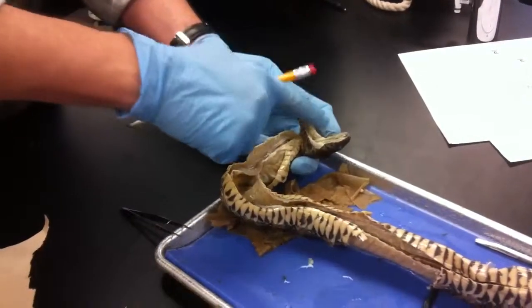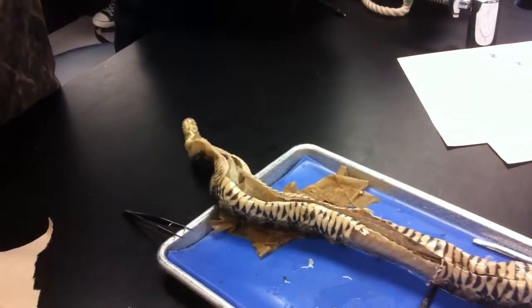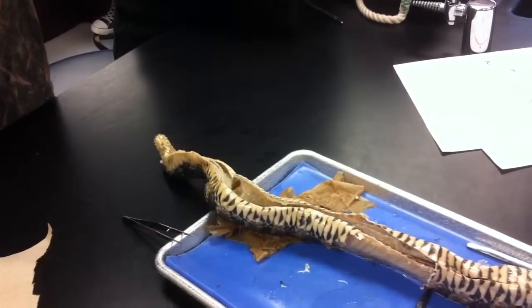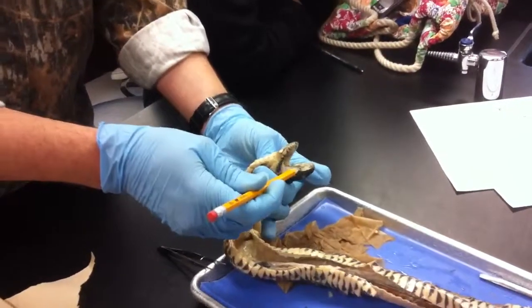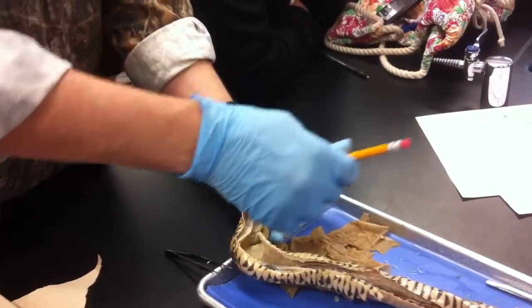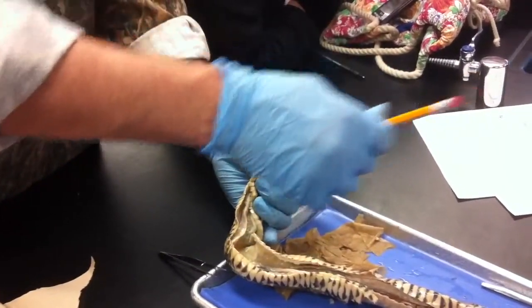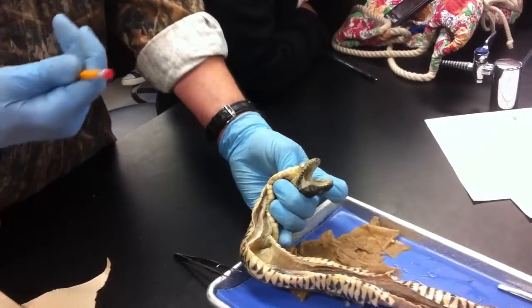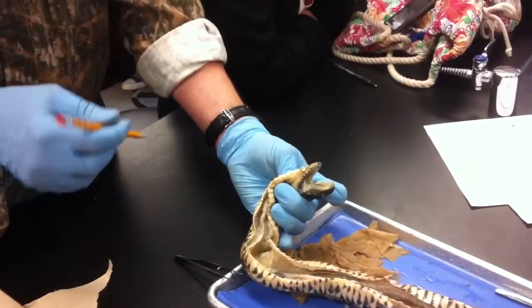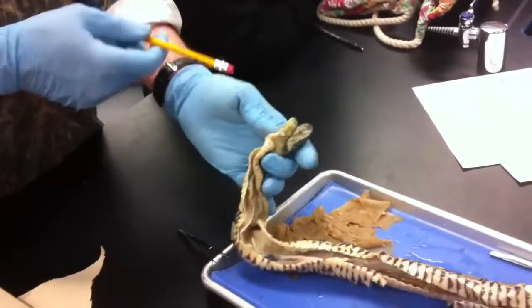These 2 inner rows, these palate teeth, they go like this. When they move forward, the teeth release, hook in, push back. Move forward, release, hook in, push back. And they use that to feed the prey item down, along with a variety of other behavioral things we'll talk about in lecture. So make sure you look inside the mouth.